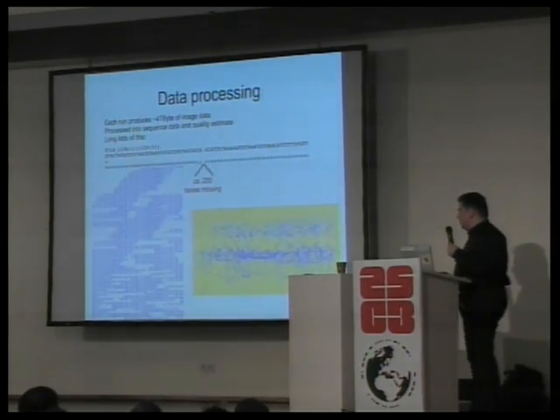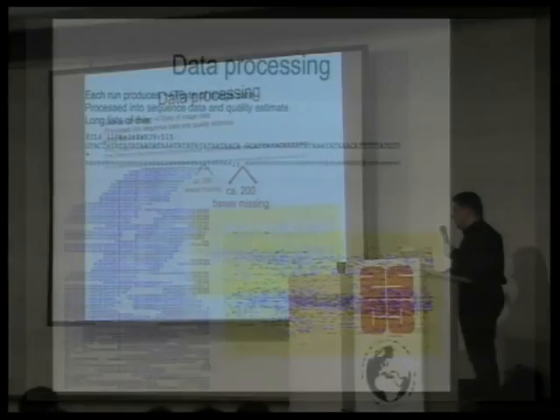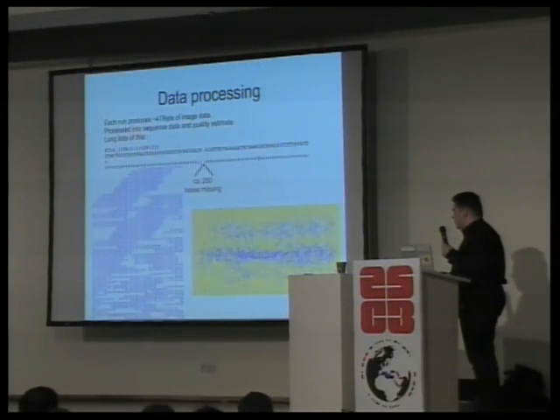This is the same view, a little more condensed, so there's a little more data on here. And maybe you can see this, the ends are in blue, and in gray is a missing part. So basically, down here, imagine this is your DNA, your chromosome, and it goes along here, and this is where these reads fit.